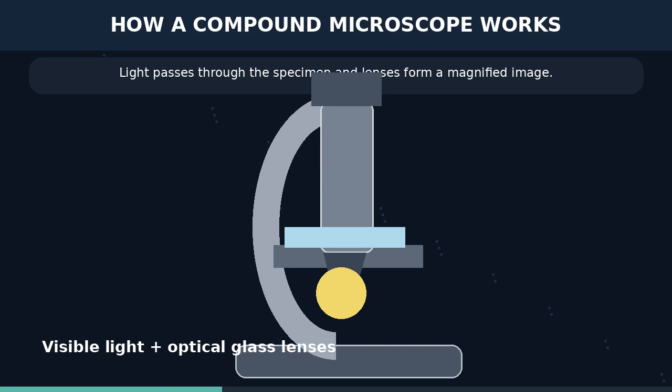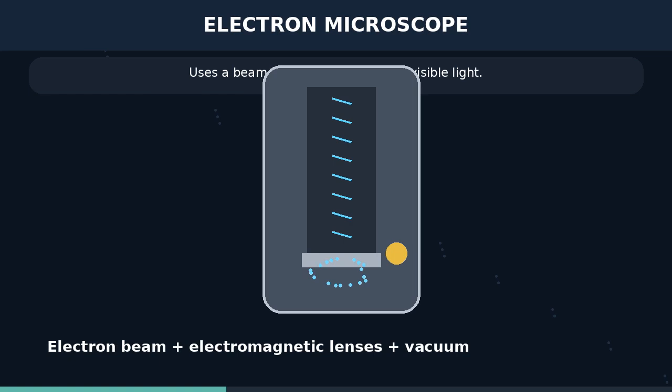Electron microscopes usually operate under vacuum conditions. Specimens also require special preparation. This means electron microscopy is very different from ordinary light microscopy. There are two major types of electron microscopes, SEM and TEM.